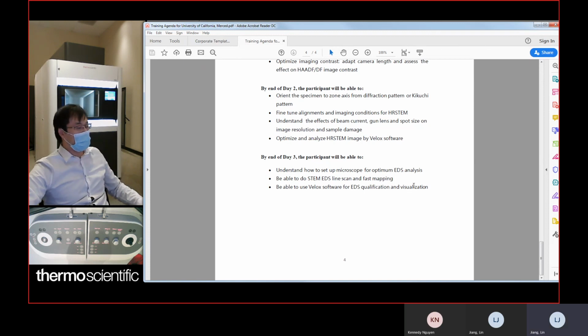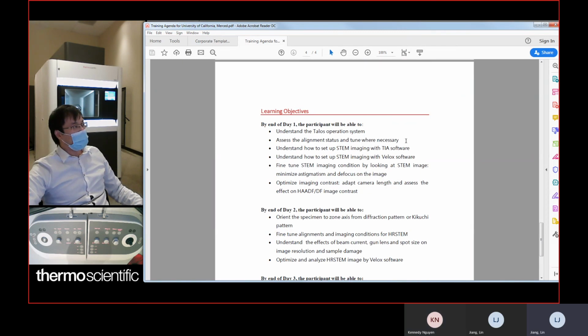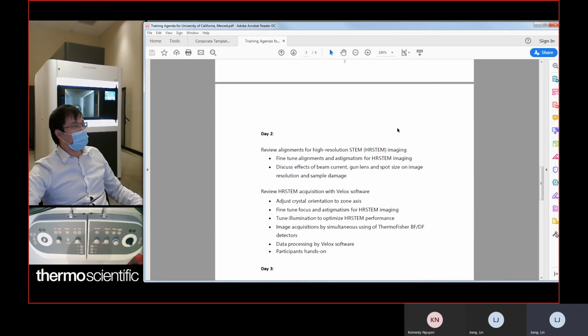Any questions about the objective? No. Okay. So this is all of it.